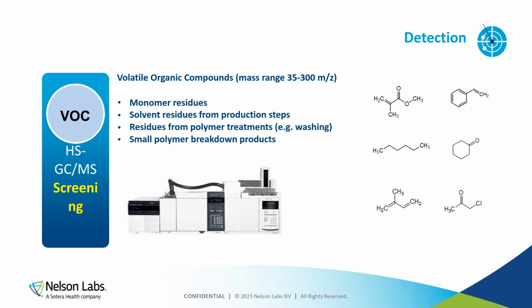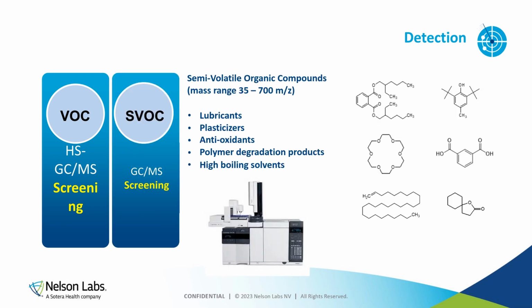So the small molecules are analyzed with headspace GCMS. This is headspace gas chromatography with mass spectrometric detection. So typically here we screen for all kinds of monomer residues, solvent residues, residues from various polymer treatment steps, and small polymer breakdown products.